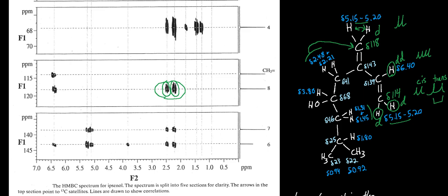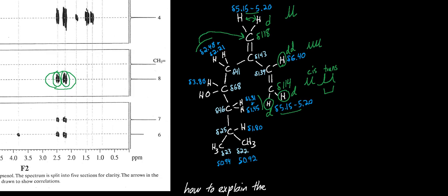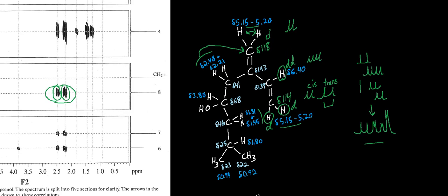So if we try to overlap all these to create a signal that looks like what appears above, we might see a doublet, another doublet of doublets overlapping, and then maybe another couple of doublets overlapping. And it's not hard to imagine that if you connect all these, you end up with some sort of signal that looks like what we're seeing, with overlap on all of these three ones on the end. So that would be my explanation for that.